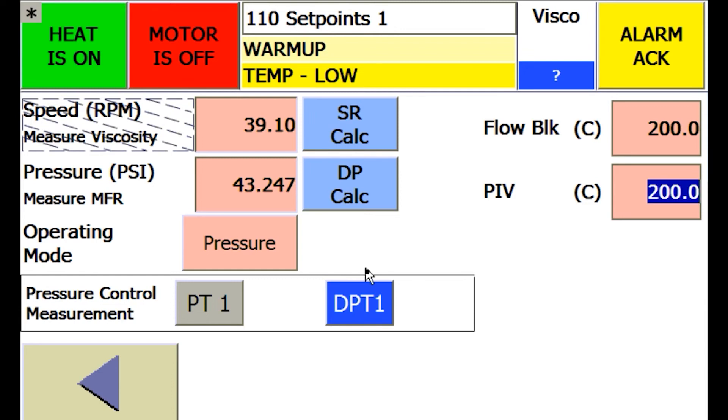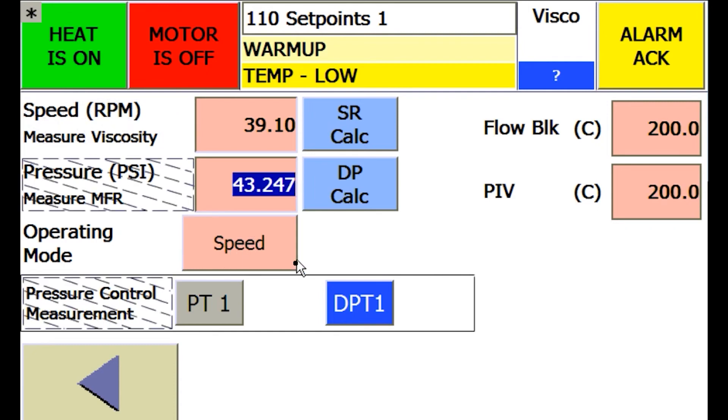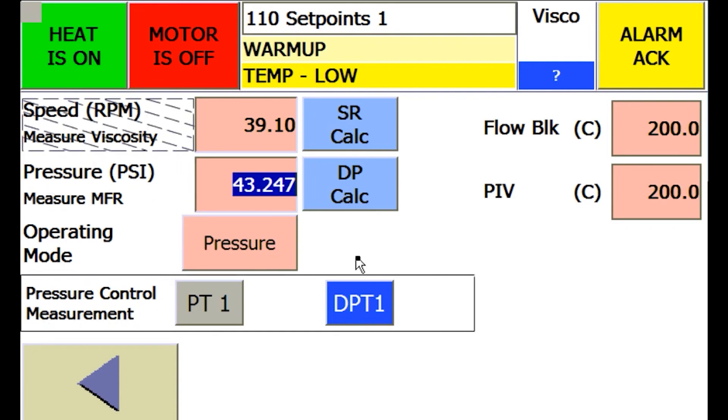The system has two modes of operation, pressure control or speed control. Simply press the mode button to switch between them. Notice that the unused set point of pressure or speed will be hatched to highlight which mode of operation is being used.